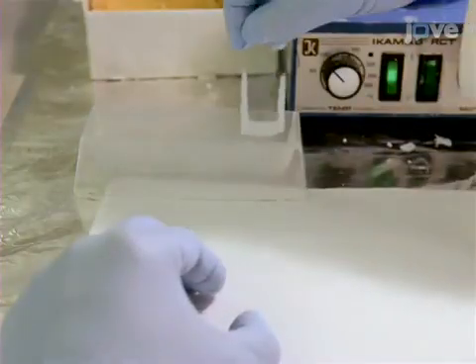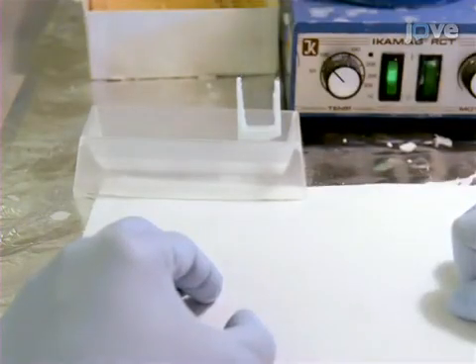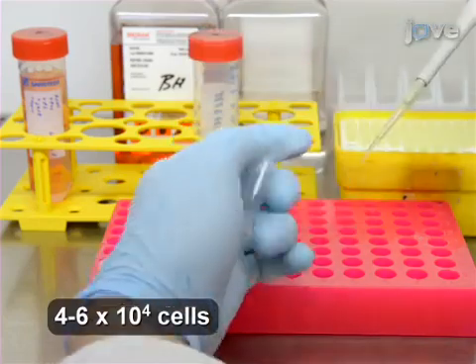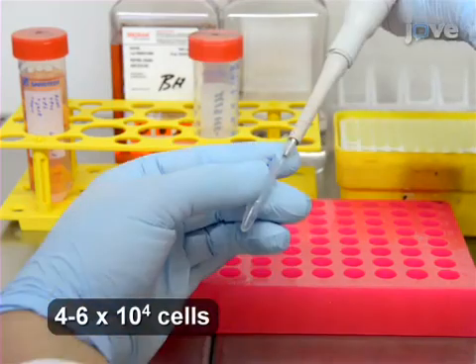Then place the migration chambers in an upright position in a rack. To 1.5 milliliter reaction tubes, add 20 microliters of the cell suspension.